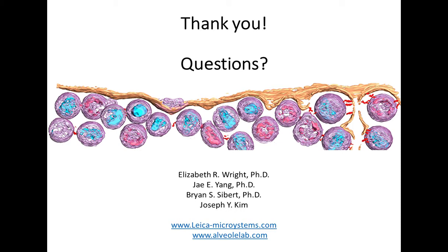Thank you so much. And we're going to come back to you, Brian. Without using micropatterning, would the cells grow randomly on the grid? And is micropatterning absolutely necessary?